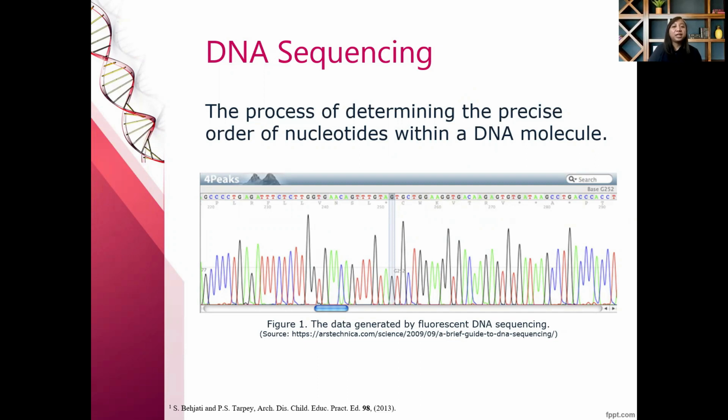DNA consists of a linear string of nucleotides or bases. For simplicity, they are referred to by the first letter of their chemical name: A for adenine, T for thymine, C for cytosine, and G for guanine. The process of deducing the order of the nucleotides in DNA is called DNA sequencing. Since the DNA sequence confers information that the cell uses to make RNA molecules and protein, establishing the sequence of DNA is key for understanding how genomes work.